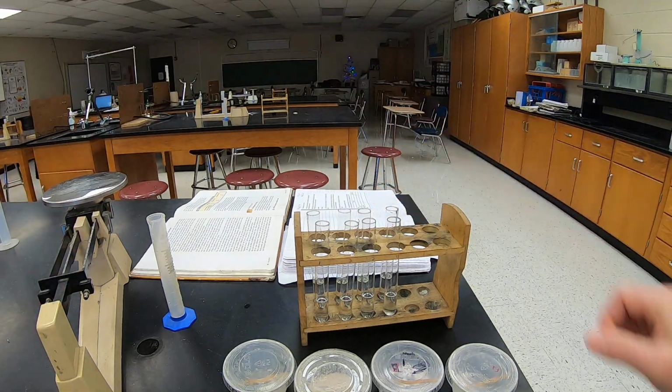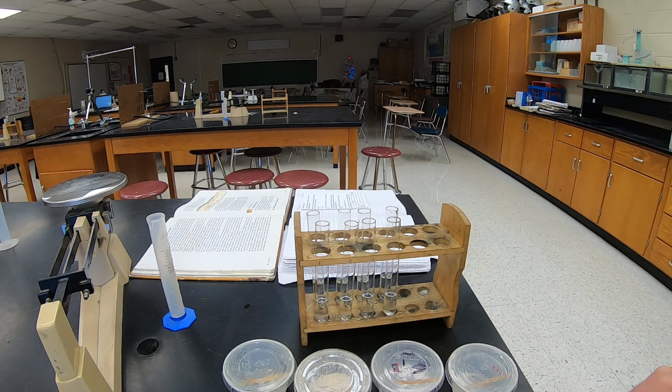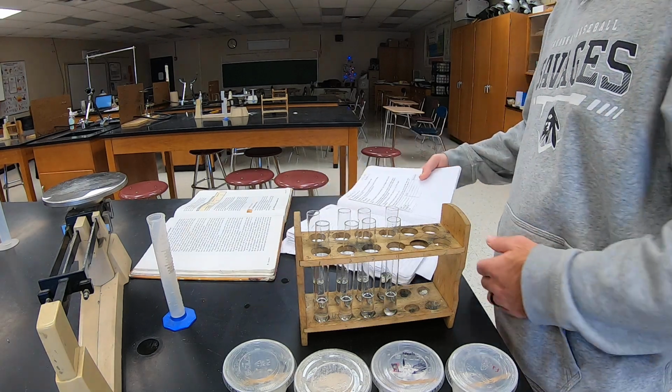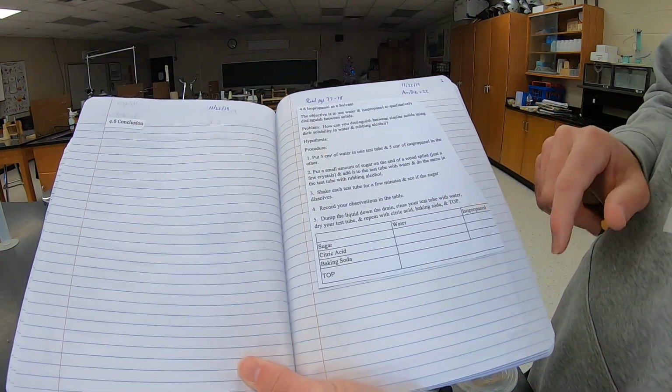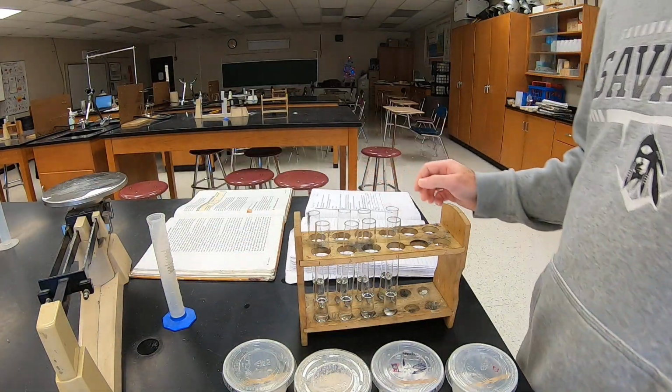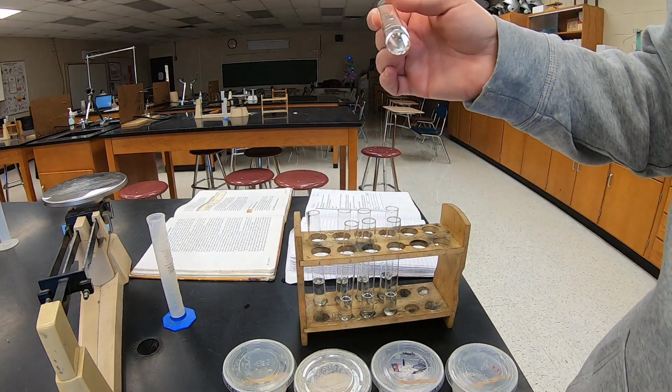Okay, so we just want to see if these substances dissolve. Okay, we don't care how much, we don't care what the solubility is, just if they're soluble. So yes or no. So on your data table, all that you really need to put is just yes or no. Yes, it dissolved, or no, it did not. So we're going to go through these one at a time. Let's look at sugar first.